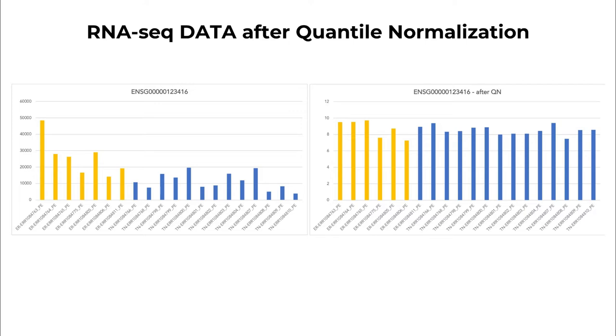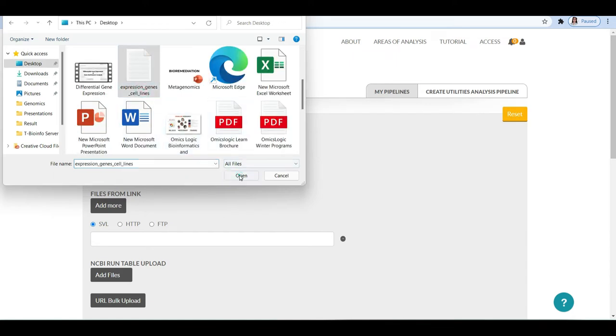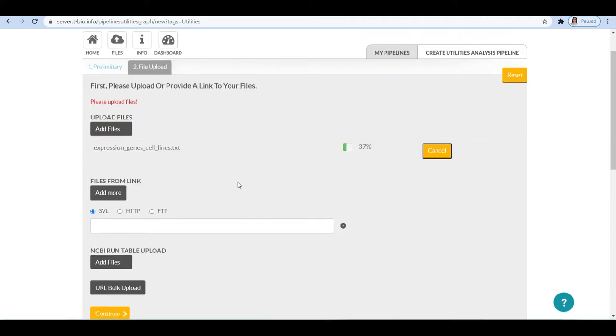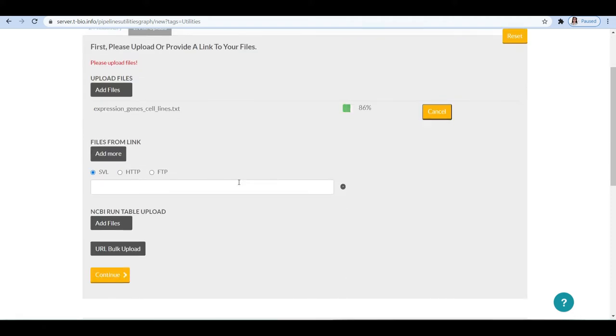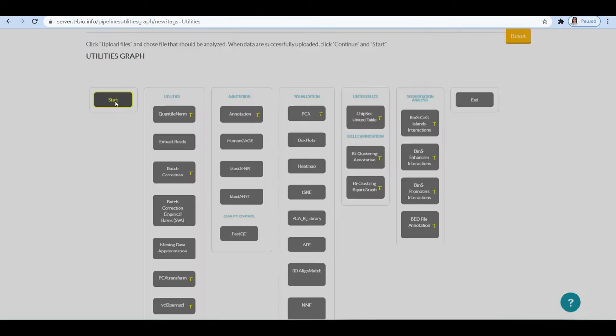Quantile normalization is a technique of mapping original values to the corresponding quantile of a standard distribution. Here, an estimation of the sequencing depth of an experiment is determined by an upper quartile of its counts. Comparing quantile values instead of raw values will eliminate differences solely rooted in the technical variation, such as the amount of RNA sequenced, sequencing machine type, or even unexplained differences that arise between different technicians following the same protocol.